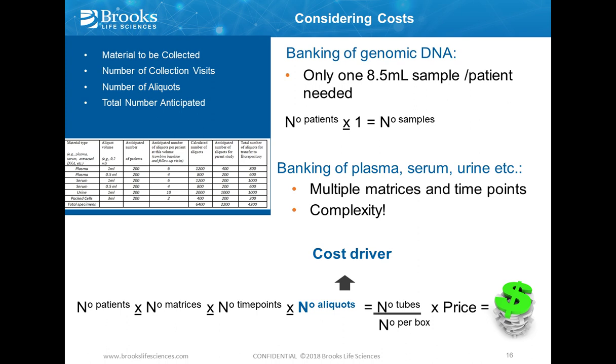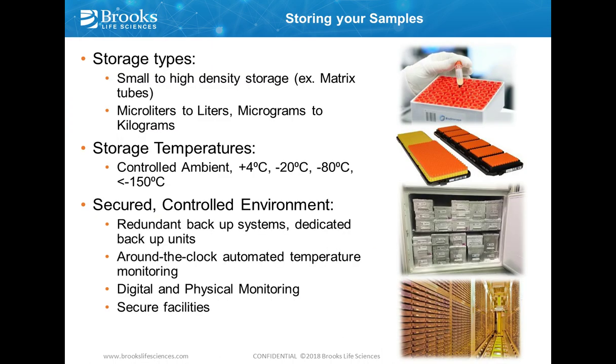So, for example, I had one particular trial where it was meant to be a rather modest collection, and essentially by the time that we started looking at all of the single-use vials that were initially requested, those numbers can go up tenfold from what's actually going to be needed for a study.